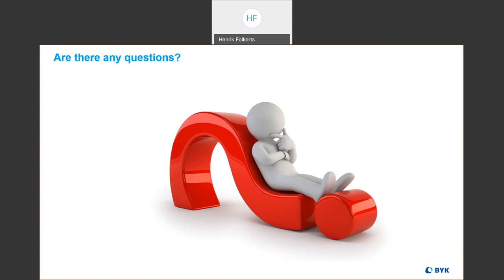So next question. When do we need to use Koenig or Persoz pendulum hardness? You can use both Persoz or Koenig, both are possible, but when you have a soft sample it is recommended to use the Persoz because it is more accurate.